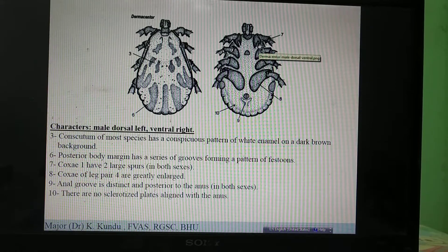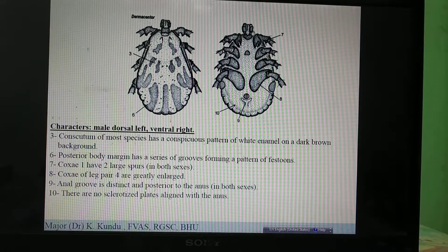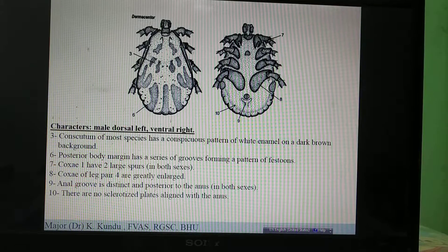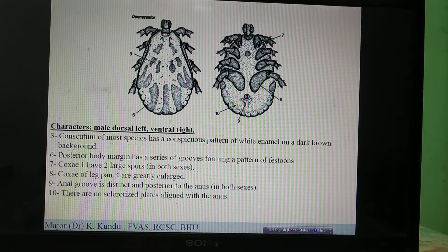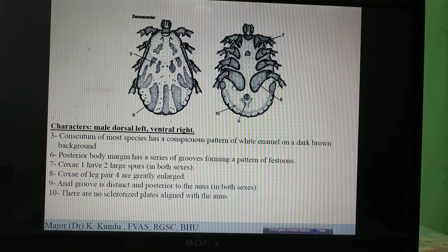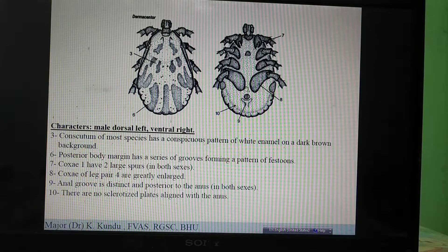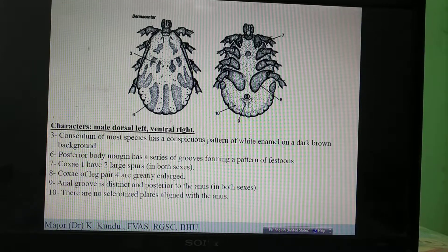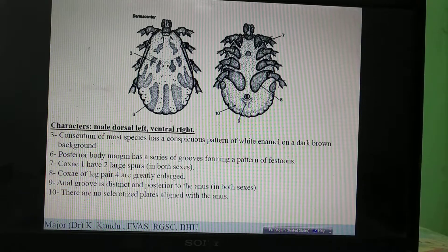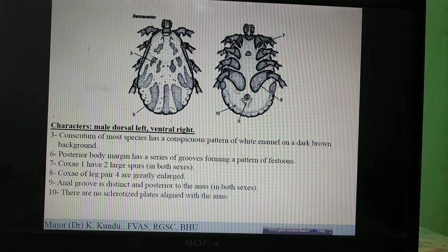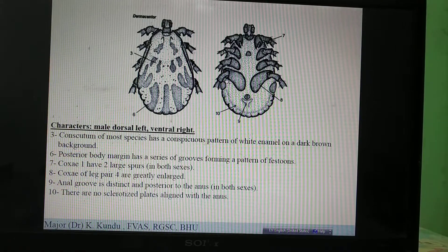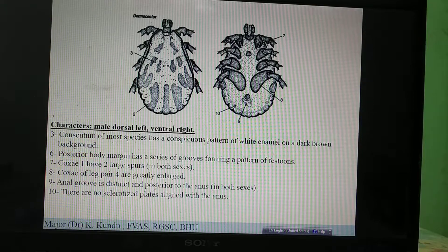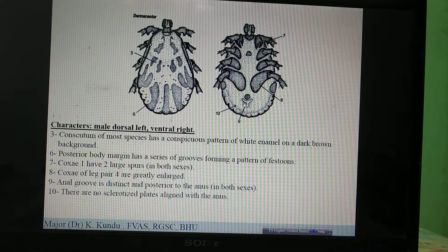You differentiate Dermacentor from Hyalomma by the mouth parts. Then, looking at the fourth coxa — the fourth coxa is the largest in Dermacentor, it has a very large fourth coxa. That is one important character. There is also a posterior anal groove.